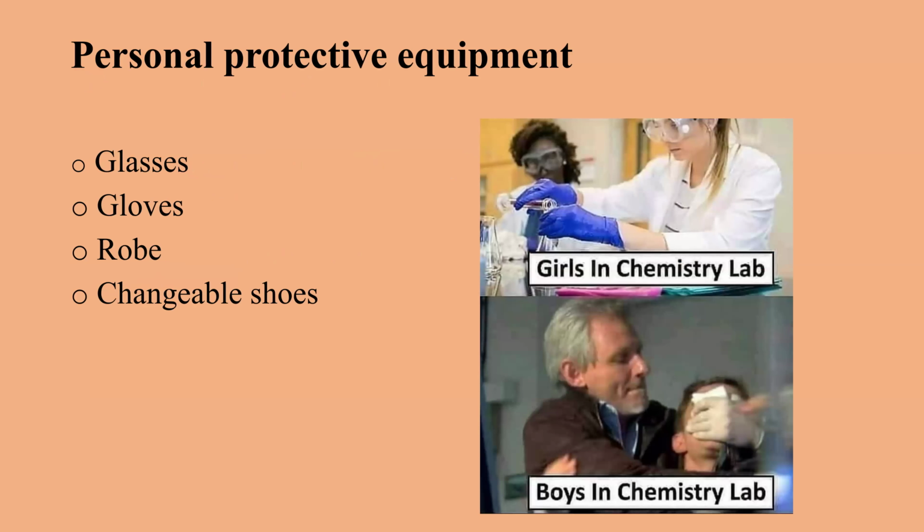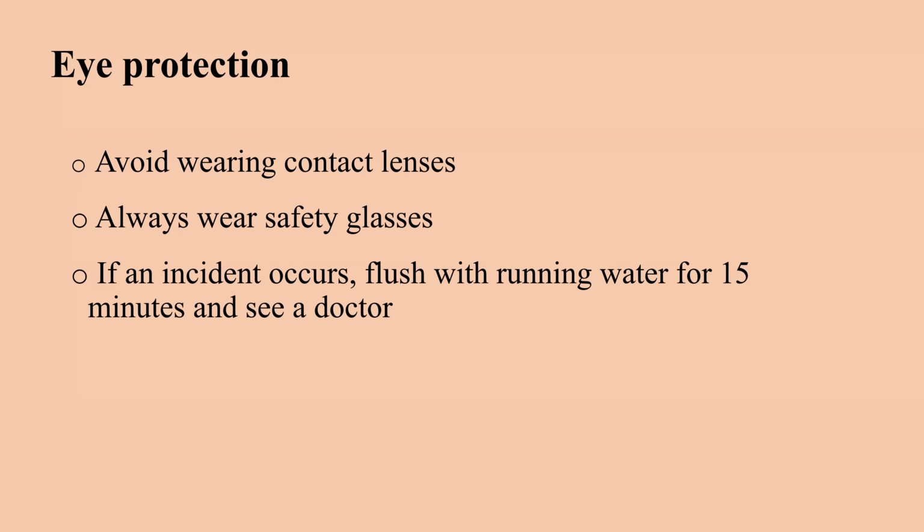Very important is personal protective equipment. First it's glasses, gloves, a special robe, and shoes. We change into it when we go to the lab. People who use contact lenses in these processes can very easily contaminate them with chemicals.